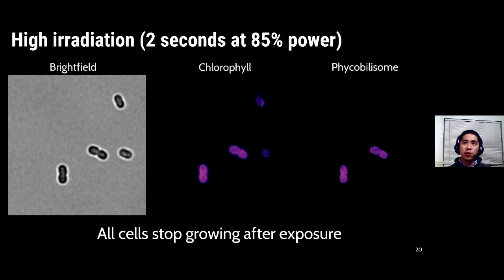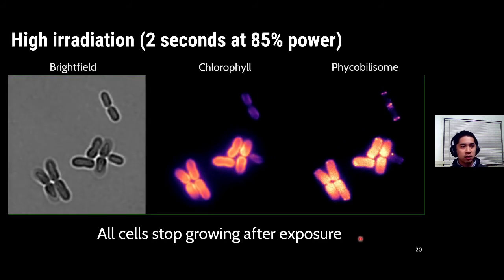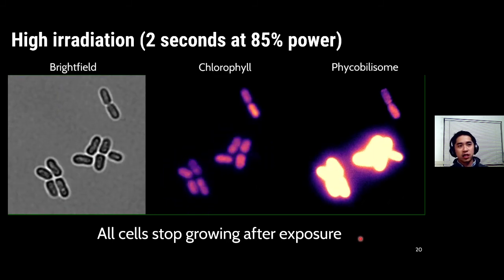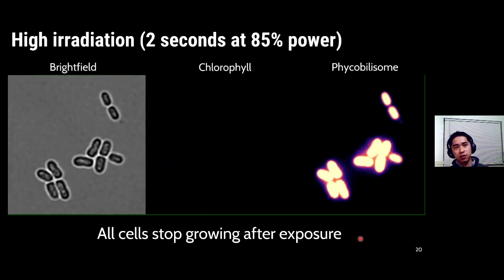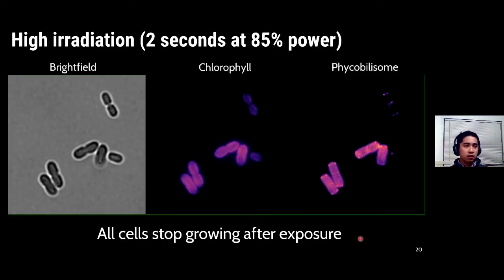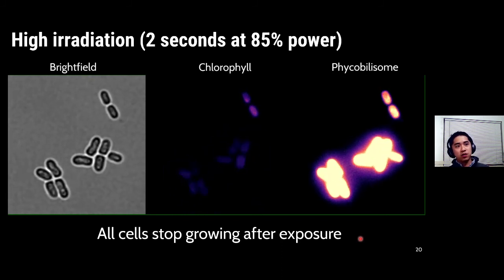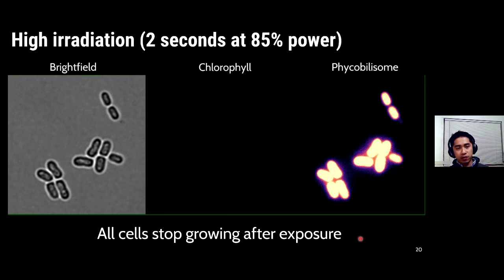All right, let's see what happens when we illuminate the cells with more light. So again, here you can tell from the fluorescence channel that these two cells are the delta CPC cells, and these two here are the wild-type cells. So let me play the video. Cells get blasted with light. And you'll notice that they basically get bright, and then they go dim. So let me play the video one more time. Now one thing I'd like to point out here is that you'll notice that basically once the cells are irradiated with the blue light, they all stop growing.